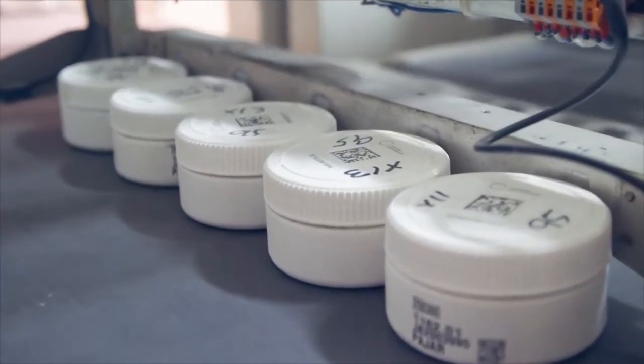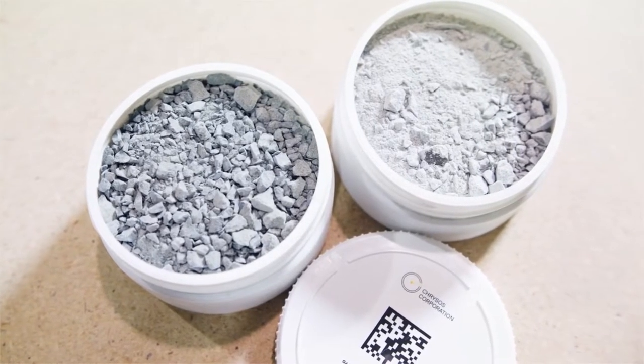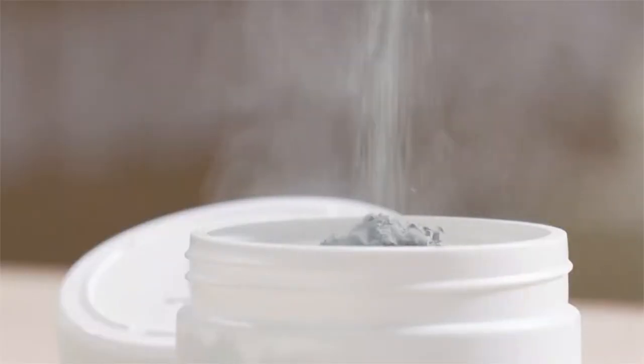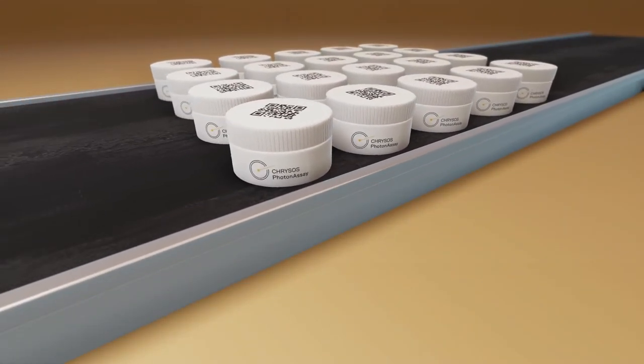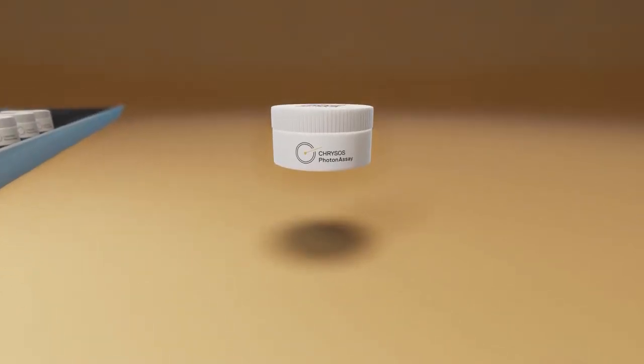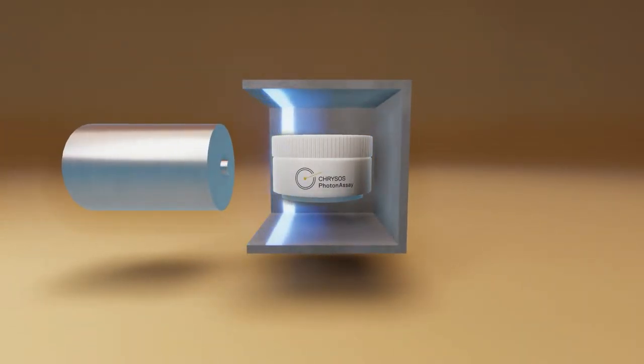This methodology enables Photon Assay to analyse samples with high precision within an applicable range of 0.01 grams per tonne through to 35,000 grams per tonne. The sample jar and reference disc are then positioned for analyses inside purpose-built shielding prior to activation.